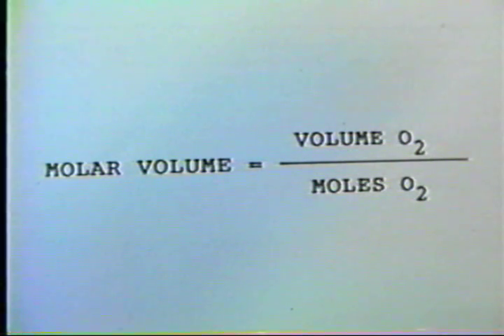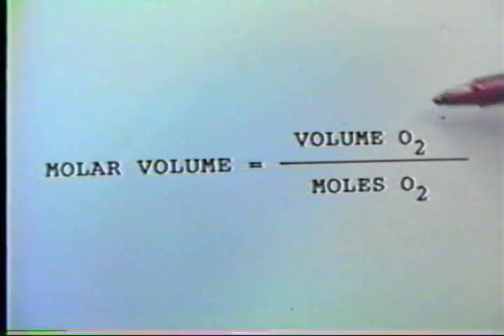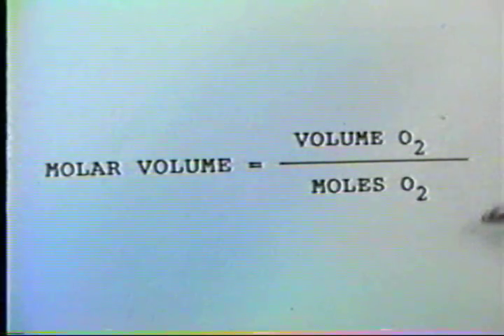In our experiment today, we'll be generating oxygen, and we will be determining both the volume of oxygen generated and the weight of oxygen which has been generated. And of course, from the weight, we'll be able to determine the moles of oxygen generated. And then from this information, as you can see by this equation, we'll be able to determine the molar volume.